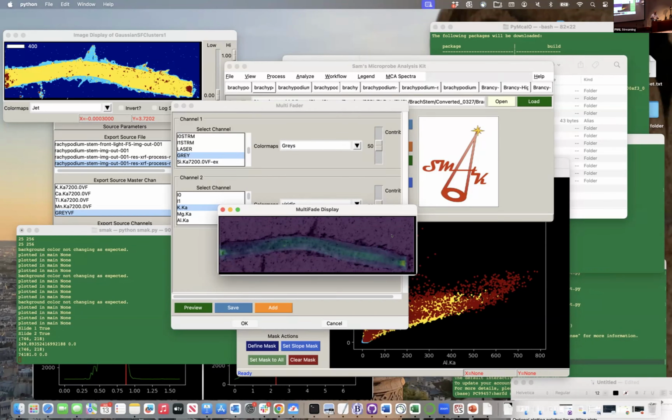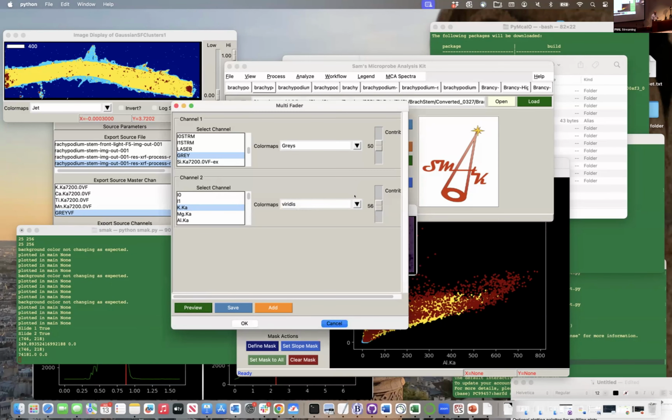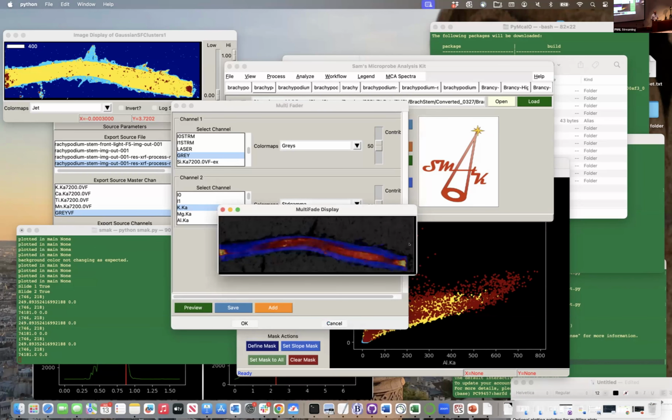If I use a color map that has a black background, it's called the standard gamma, I believe, which is really the maps color map, if you're familiar with APS data. Stefan Vogt's fault on that one. Again, it has that black background, so it doesn't give a weird color tinge, but it makes everything darker. And so what you really want to do is add a thresholding.